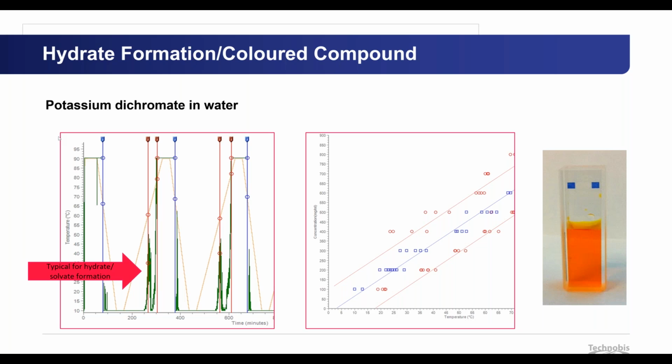And this we have understood from this profile, how it tries to get into solution, gets out of the solution here by seeing this peak, and then goes again into solution and crystallizes again. So once again, the transmissivity data from your experiments can tell you much more than just a simple clear and cloud point. Just to give you an idea.